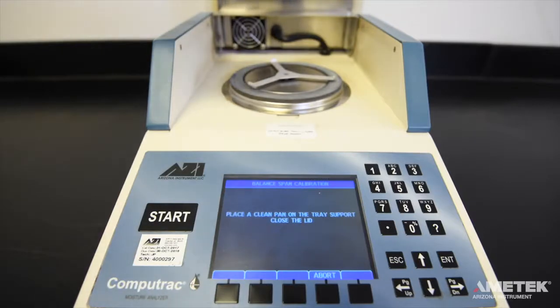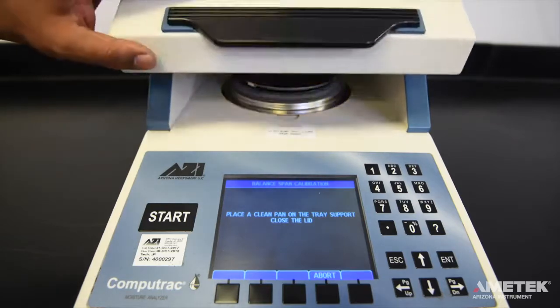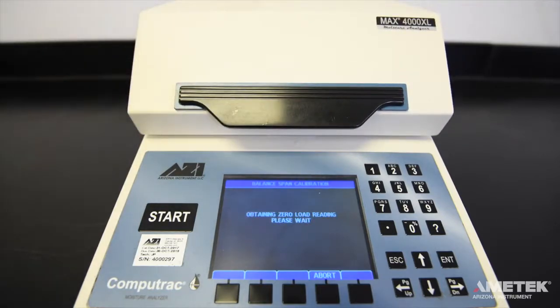After placing a clean pan on the pan support and closing the lid, the instrument will begin obtaining a zero-load reading. This reading allows the instrument to recognize what the empty sample pan looks like and compare it to the reading when the 20 gram weight is added.